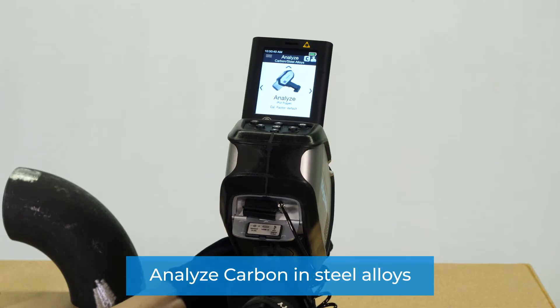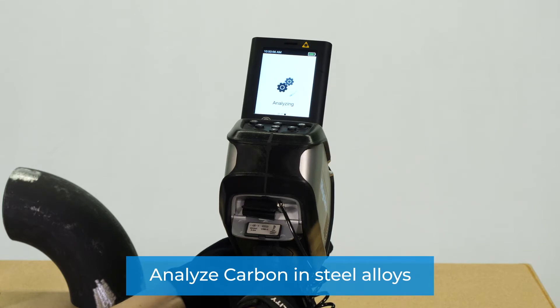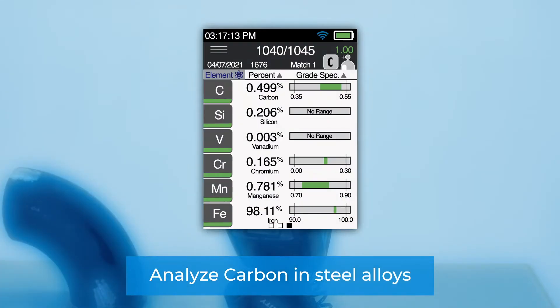With the optional assistance of a purge gas, the KT500 will also analyze carbon and steel alloys and provide a carbon equivalence measurement, so you can limit the use of the consumable to only when you need the carbon measurement.